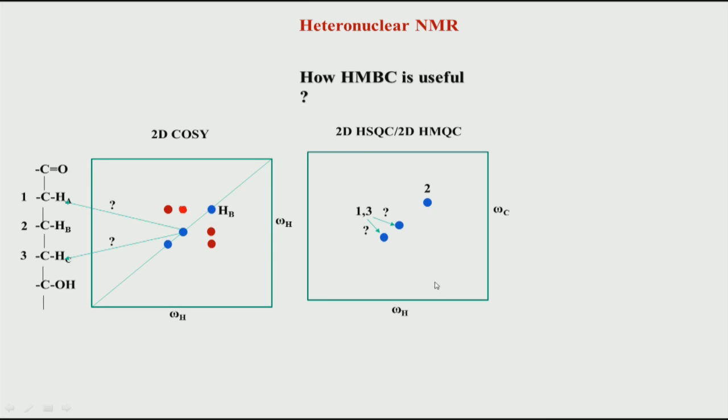How did I get this information? I got the information because I looked here and I have somehow assigned this H beta, H b, because H b is showing to both. So, I know that H b has to be in the center of the 2. So, again, you know, in this kind of system what we are trying to use is a simple logic based argument. We are not relying on the chemical shift value.